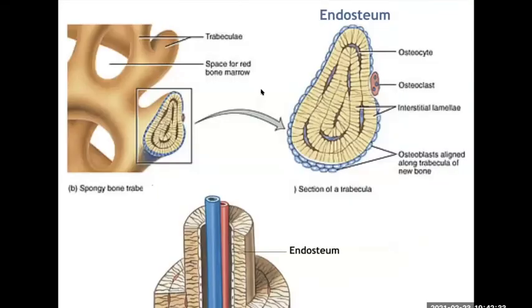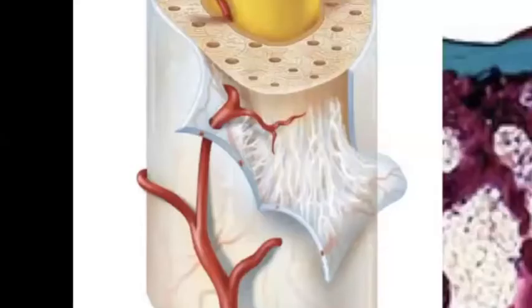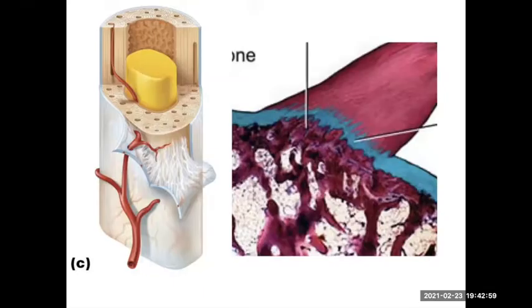So when we look at that spongy bone, with all these struts and spaces, I mentioned the periosteum on the outside of the bone. You also have another layer called the endosteum, inside, osteum meaning bone. Instead of the periosteum, which is going to have that fibrous layer surrounding it like this, it'll also have a cellular layer.